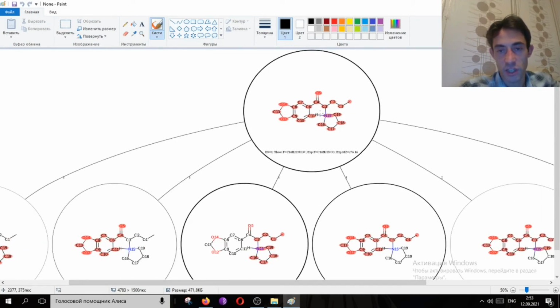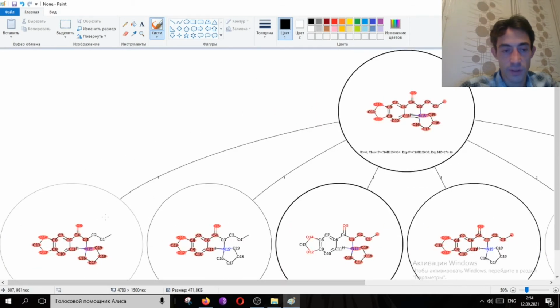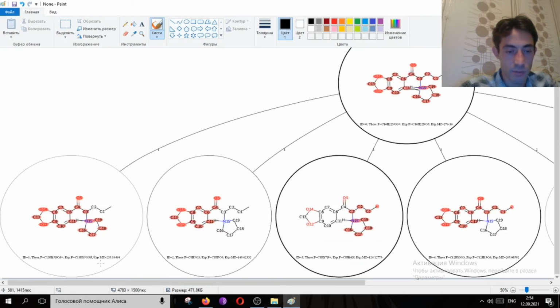We initially had a molecule of this structure protonated here, and to produce m/z 233, we need to fragment it here, and you can see formation of the fragment ion here.